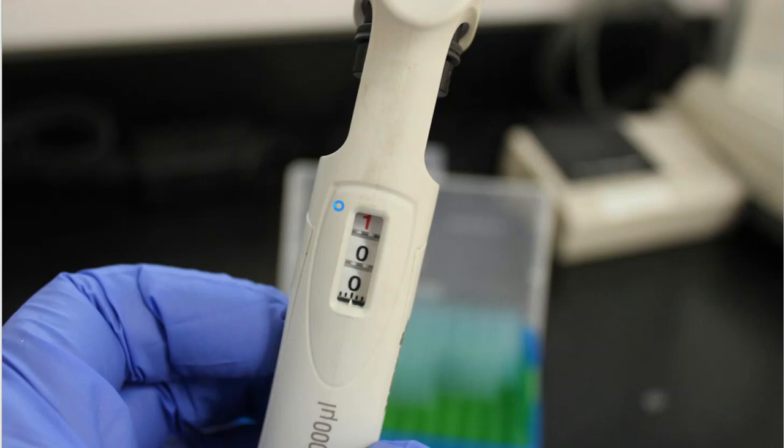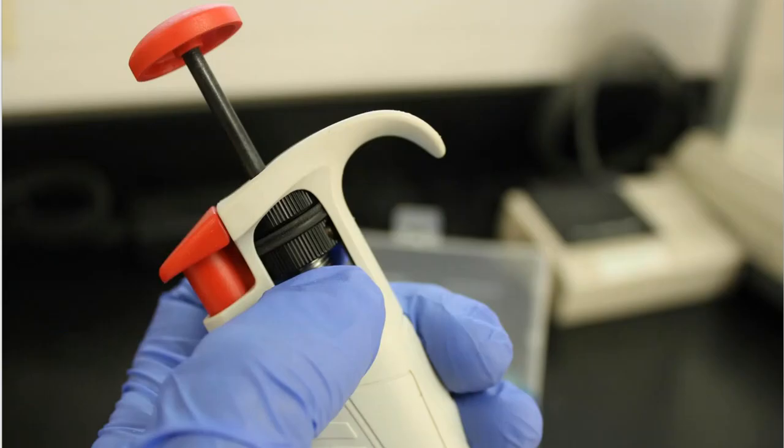So what if I get this micropipetter and it's not set at the proper value that I need? For instance, let's say we need 900 microliters, not 1,000. How do we adjust that dial? How do we adjust the micropipetter in order to give me 900 microliters or 0.9 milliliter? Well, you have to keep in mind, this represents 4 digits. So this needs to say 0, 9, 0, and then that tick mark has to say another 0. So 090 is 900, not 90, and that's again another confusing part about the micropipetters that we have.